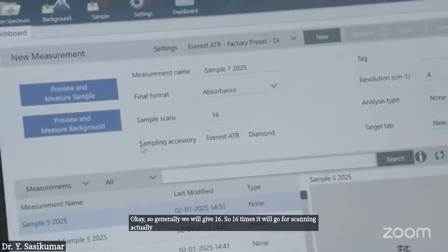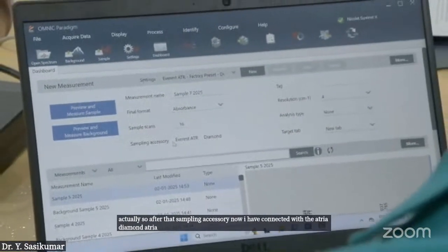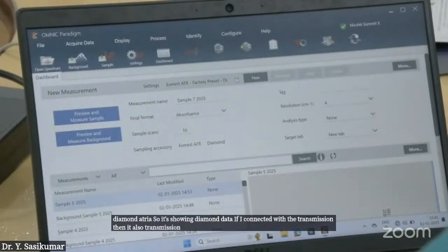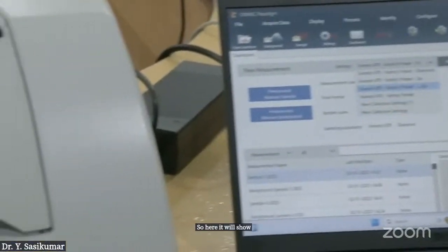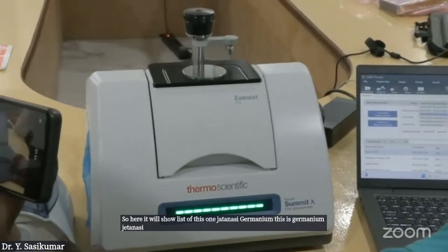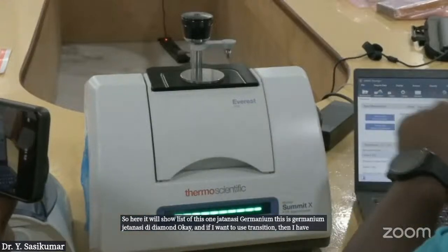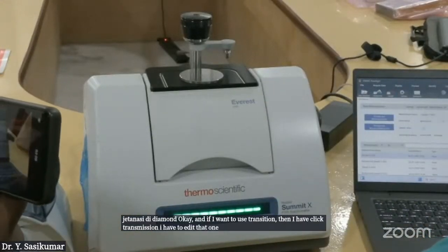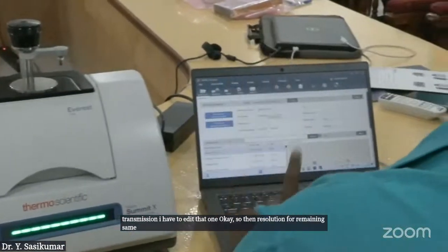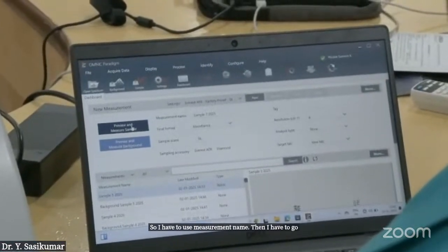After that, the sampling accessory. Now I have connected the diamond ATR, so it's showing diamond ATR. If I connected the transmission, then it will show transmission. Here it will show the list: this is germanium, this is diamond. If I want to use transmission, then I have to click transmission and edit that one. Then resolution 4 remains the same. I have to give the measurement name, then go with the preview and measure sample.